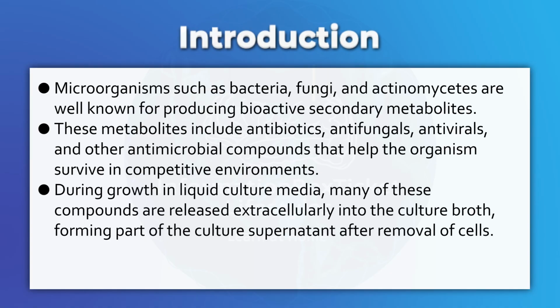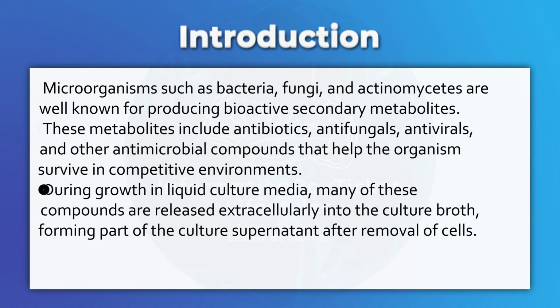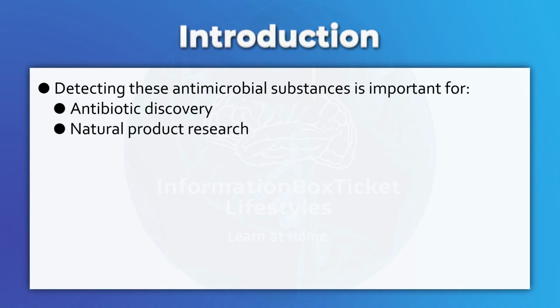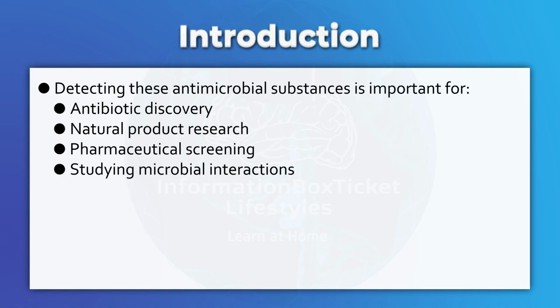During growth in liquid culture media, many of these compounds are released extracellularly into the culture broth, forming part of the culture supernatant after removal of cells. Detecting these antimicrobial substances is important for antibiotic discovery, natural product research, pharmaceutical screening, and studying microbial interactions.